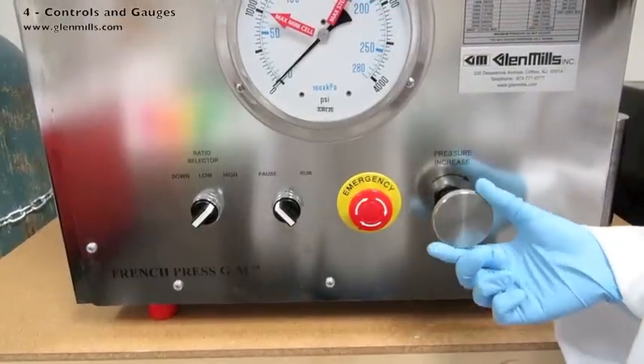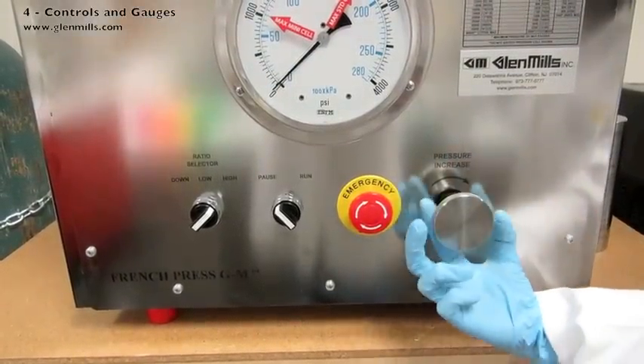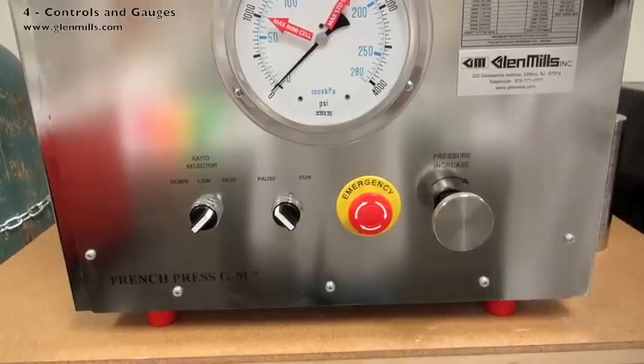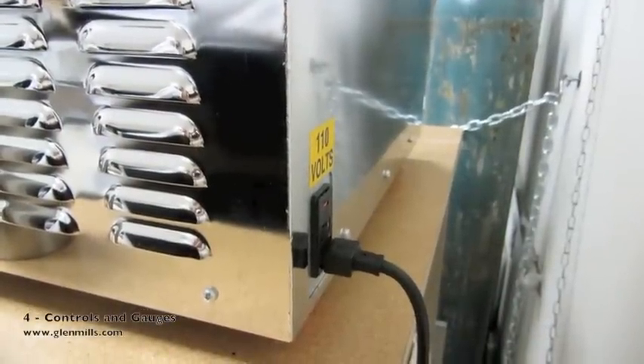The pressure increase knob is turned to control the hydraulic pressure to lower the platen and thus the pressure inside the standard pressure cell. Additionally, there is a power switch in the back of the machine.